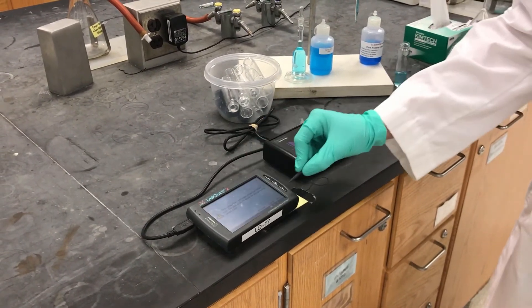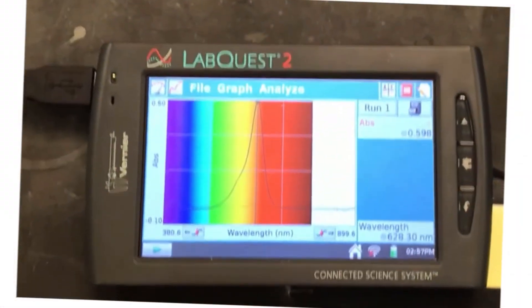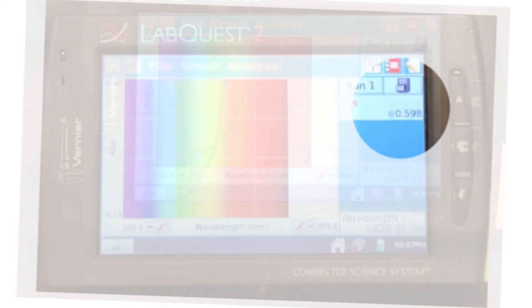Push play, then stop, and you'll see that the absorbance at lambda max is 0.598. This is a value we can use in our calibration curve.